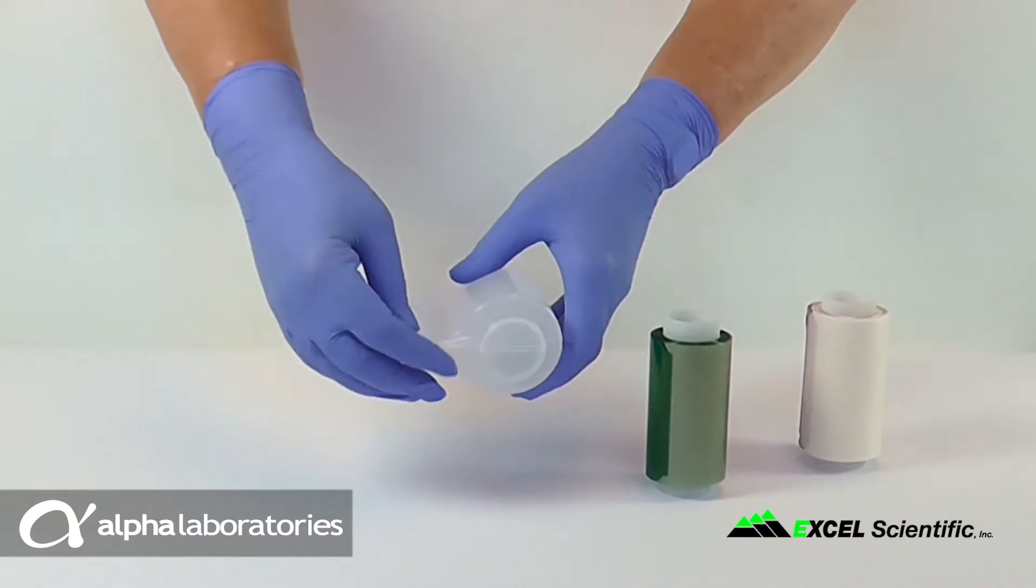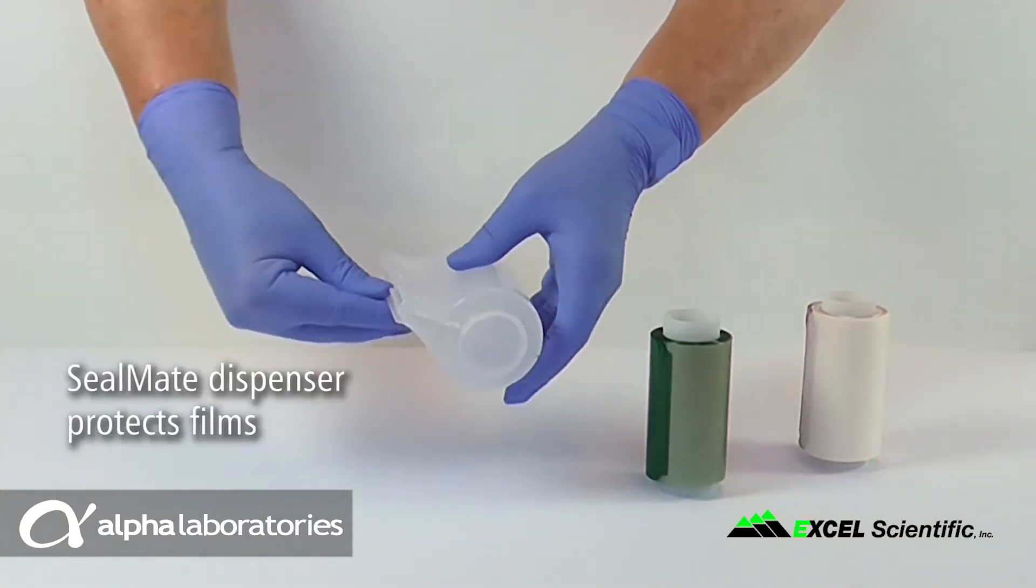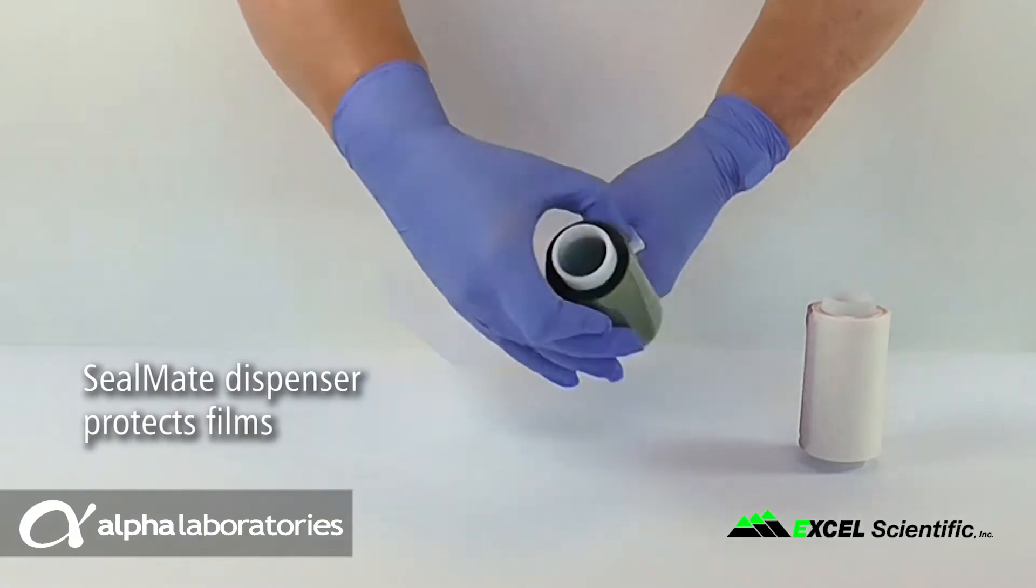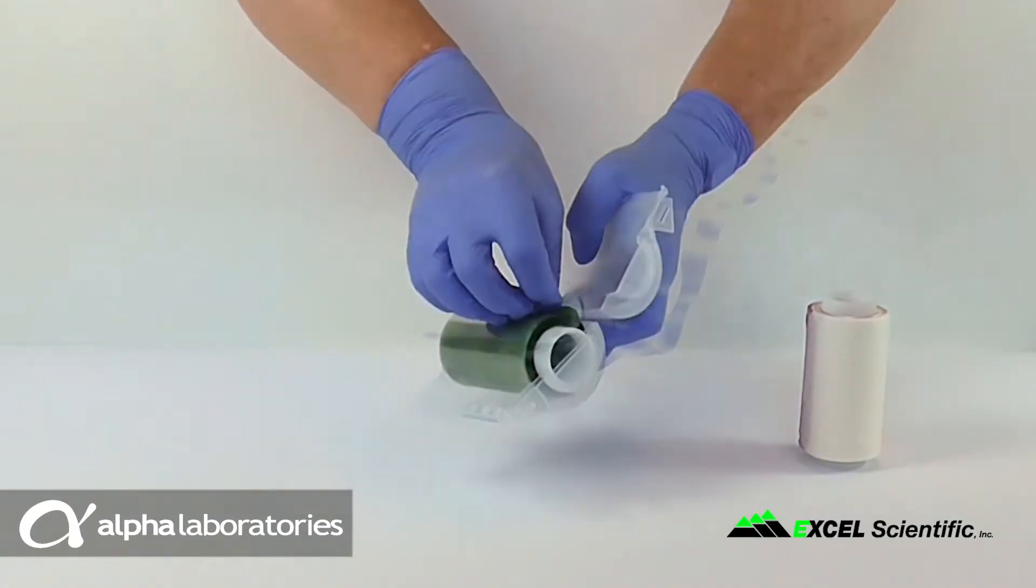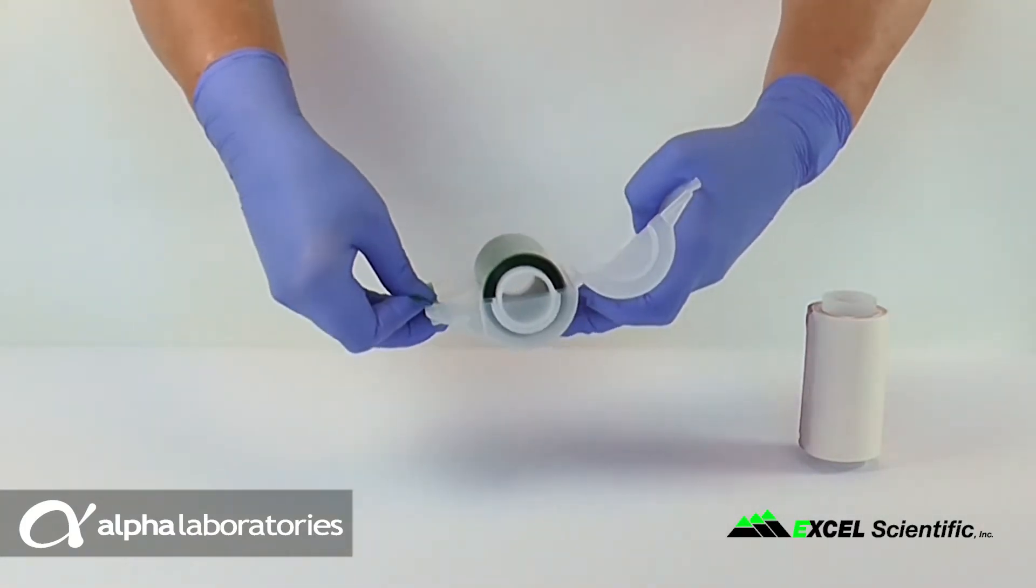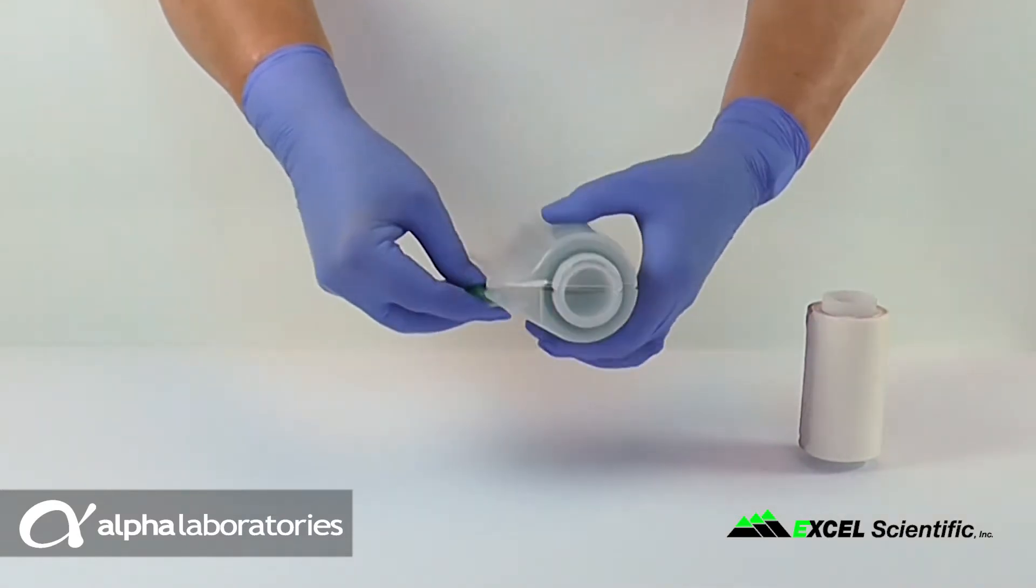The SealMate dispenser provides a protective enclosure for films on the roll prior to dispensing. It can be opened to insert a new roll then closed and latched securely by means of clasps at each side of its film dispensing bill.